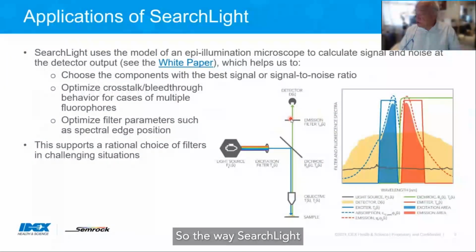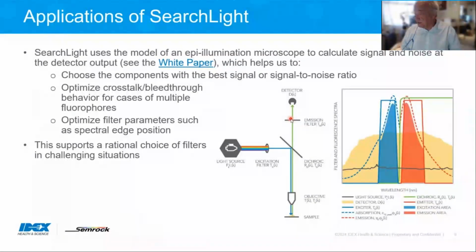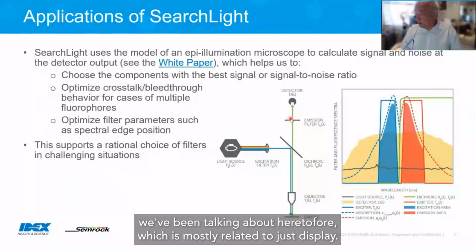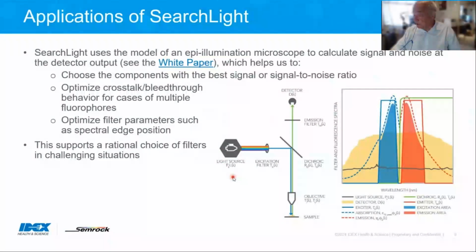So SearchLight, of course, has this ability to calculate, and that is separate from what we've been talking about heretofore, which is mostly related to just display. The way this is implemented is described in a white paper that you can lay your hands on.